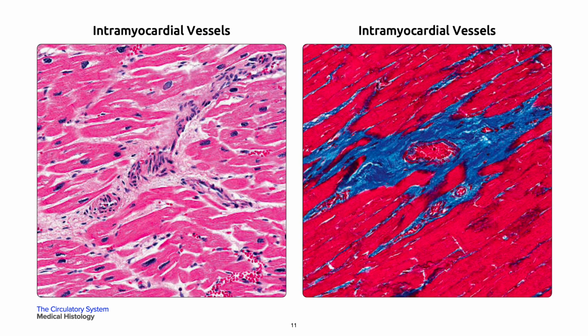On your left are the intramyocardial vessels. As the penetrating arteries and other intramyocardial vessels course through the myocardium, they are surrounded by a layer of connective tissue. This is normal and should not be confused with pathologic interstitial fibrosis.